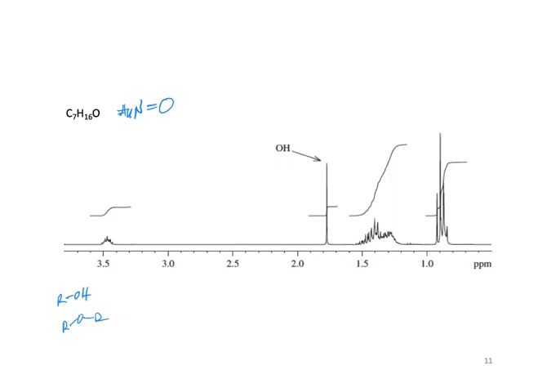If you look at this, it already says right there, though. I should have blocked that out. Well, couldn't that just be contamination or a wet sample? Because in chloroform, water shows up at around 1.5, a small amount shows up, but the more you add, the more it travels.